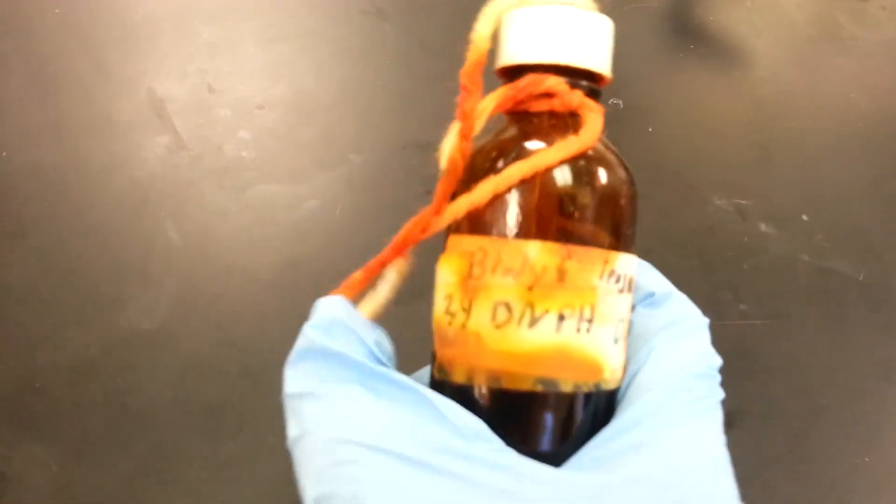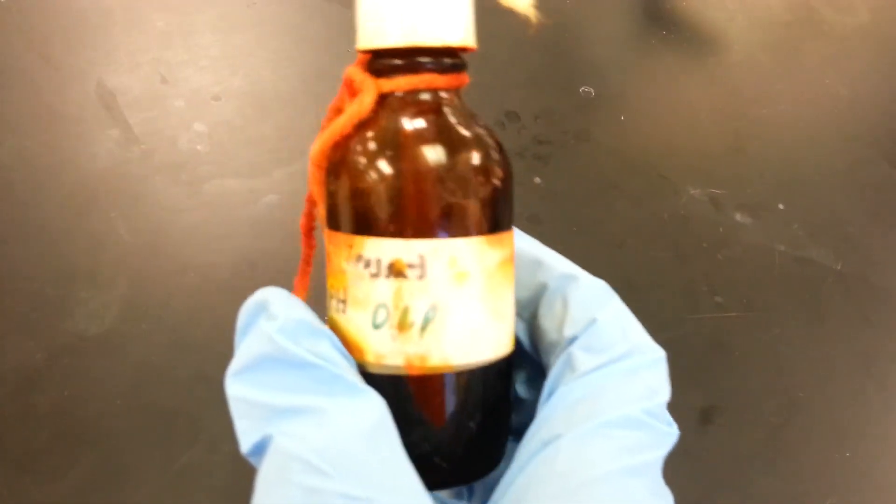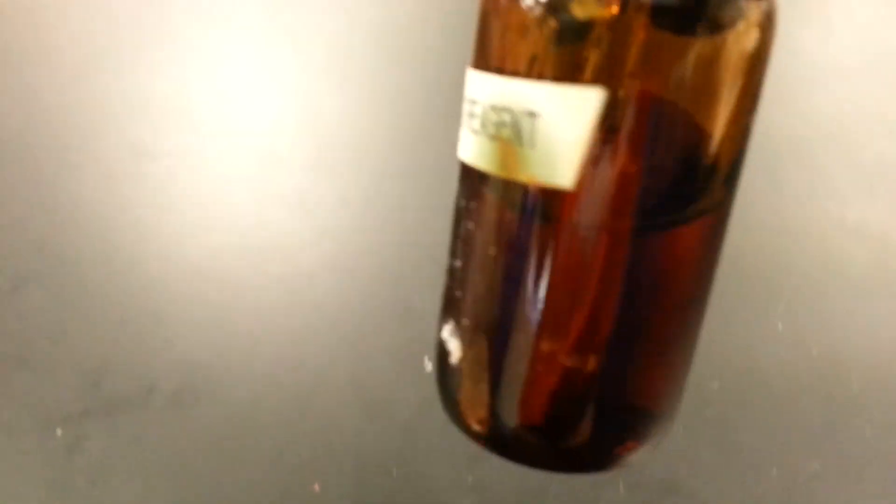As we mentioned, here's the Brady's reagent. The 2,4-DNPH. The bromine and, of course, the Jones reagent. Here's our silver nitrate, glucose, and the chromic acid. Well, that's going to be it for this video.